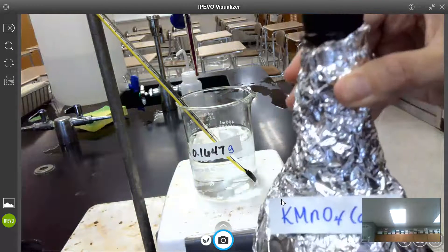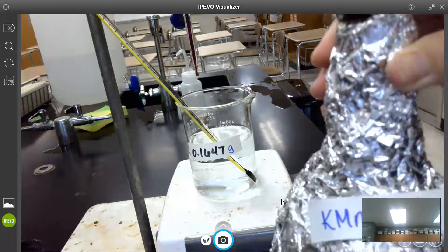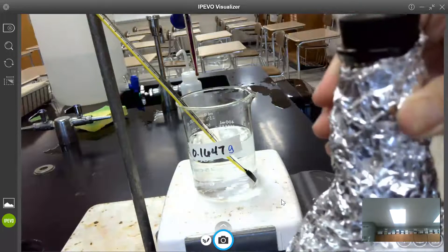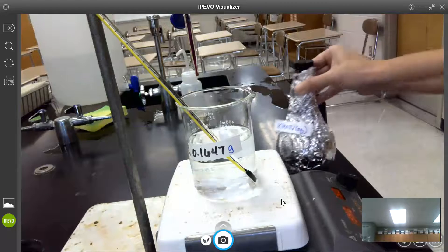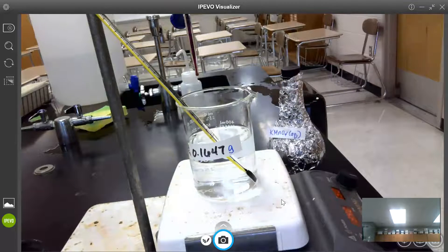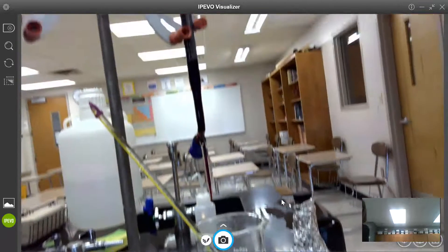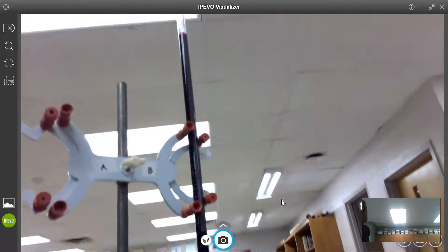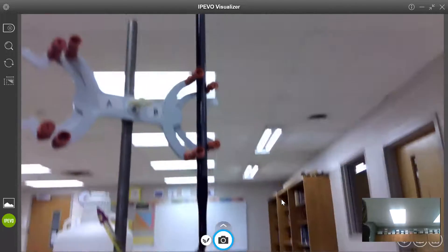We took the KMnO4 which was prepared last week and stored in the dark and we filled the burette with the KMnO4. So I'm just going to show you our burette setup that we used for the titration top to bottom.